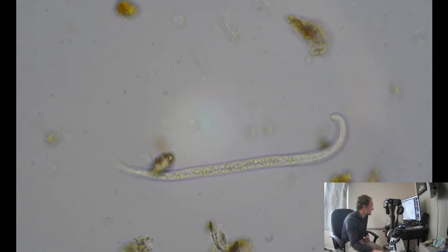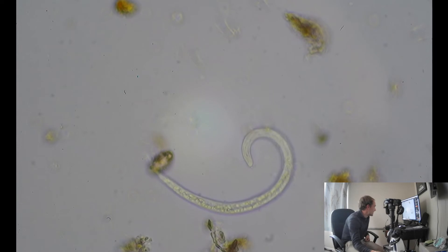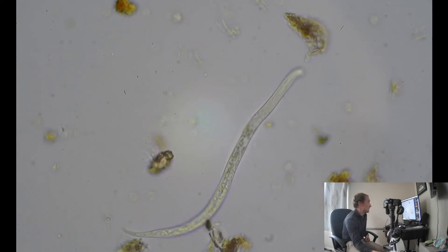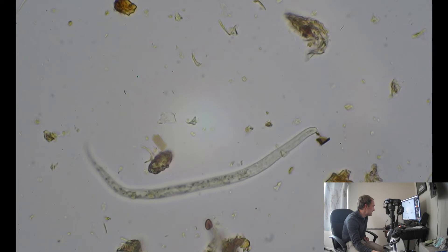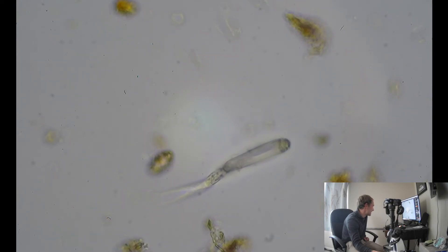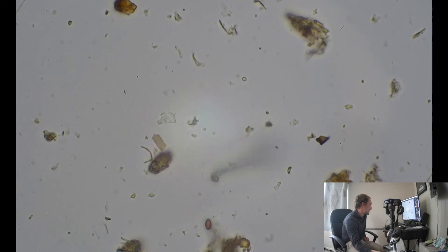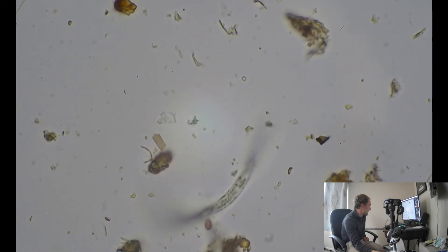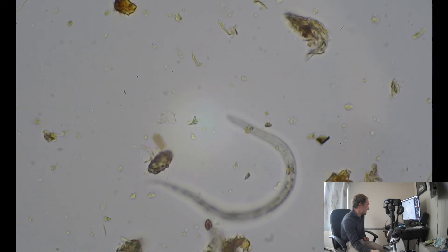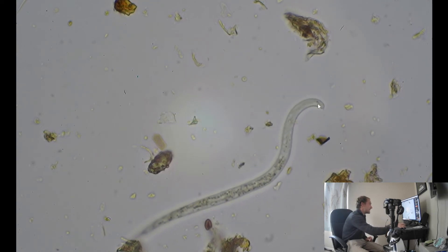Or it's just a bunch of nutrients that he sucked out of a fungus. Going kind of back and forth. It's hard to get a good focus on them. Yep, another good glimpse at it right there.